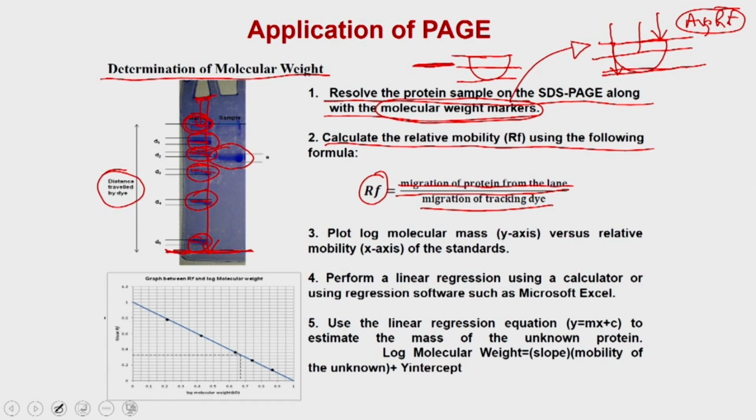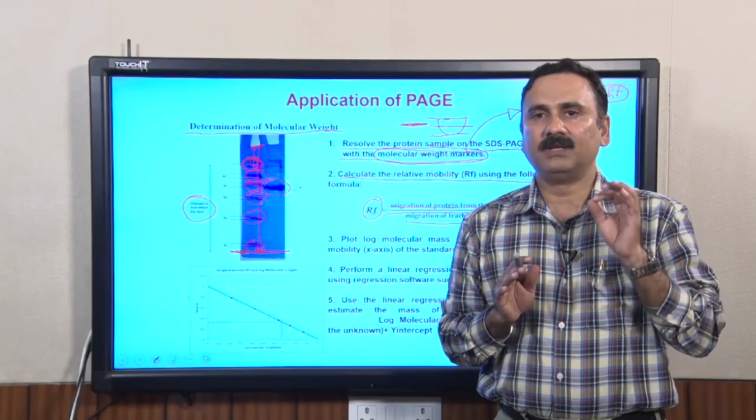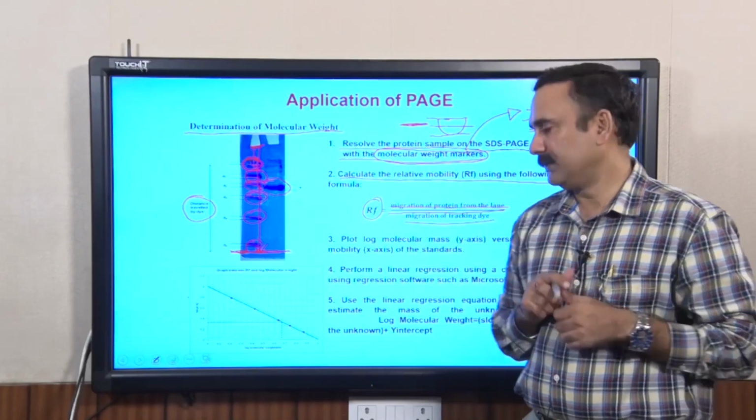That is why it is recommended that you load a very small amount of protein, so that it just forms a very thin line or thin band on the SDS-PAGE.